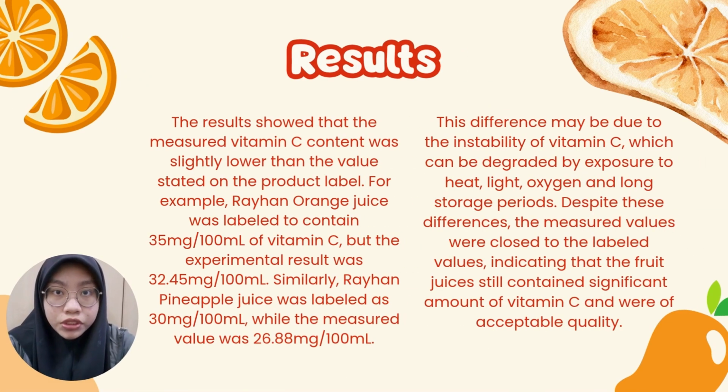The results showed that the measured vitamin C content was generally slightly lower than the value stated on the product label. For example, Raihan orange juice was labeled to contain 35 mg per 100 ml of vitamin C, but the experimental result was 32.45 mg per 100 ml.